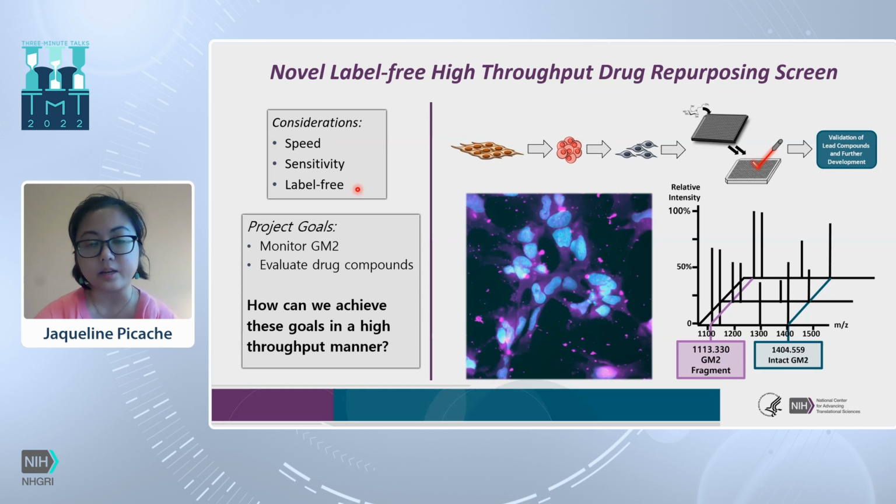Typical screens rely on antibodies or fluorescent tags, which can make the drug repurposing screen pretty expensive when you're trying to do it in high throughput. So we are trying to do this in a label-free manner.